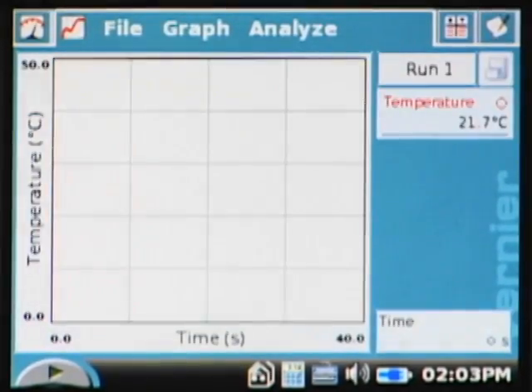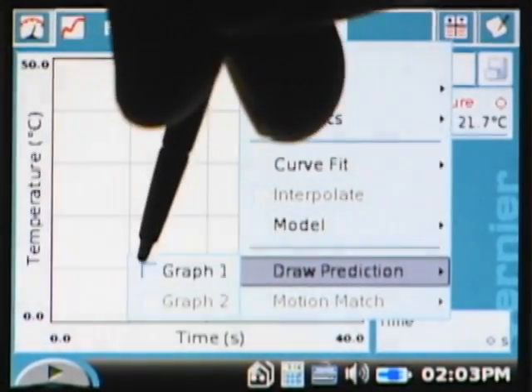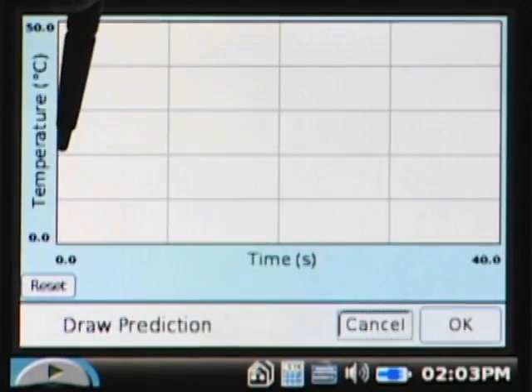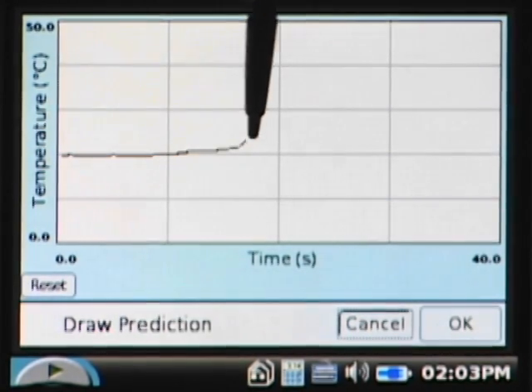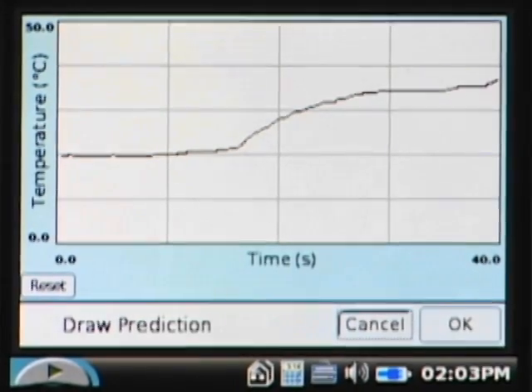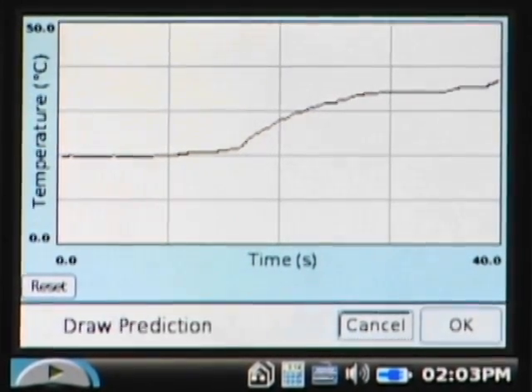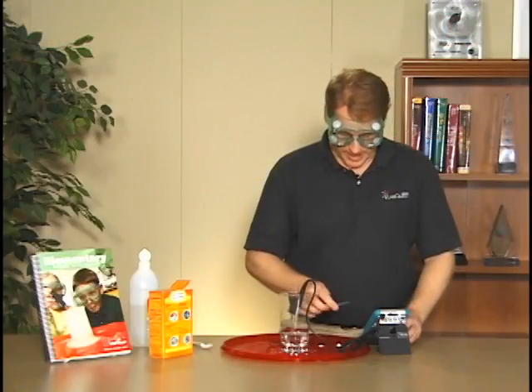I can tap on my graph view, and it's under Analyze, so I can come down to draw a prediction. It gives me a screen where I can draw the prediction. I'm going to say, well, maybe it goes along like this, and I add the baking soda and then maybe it gets warmer. If I don't like my prediction, I can always press reset and do another one, but I'm fine with that one. It draws my prediction on the graph.